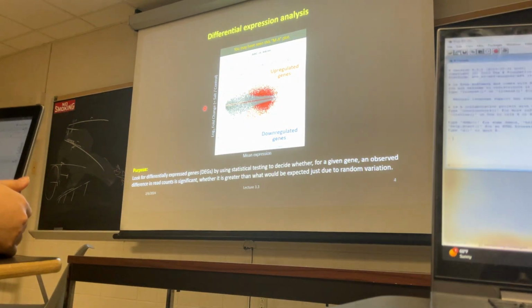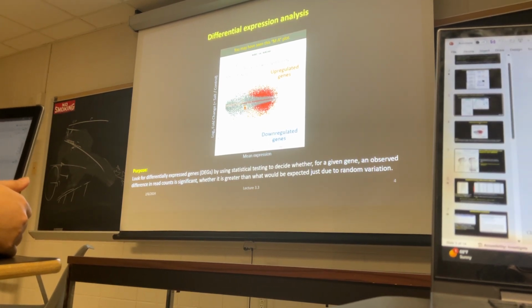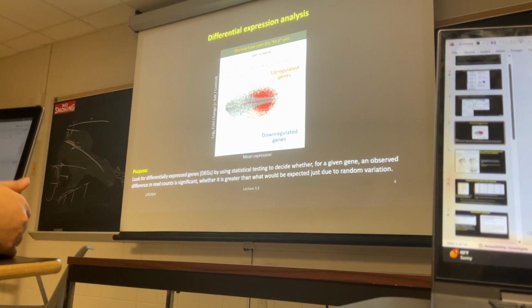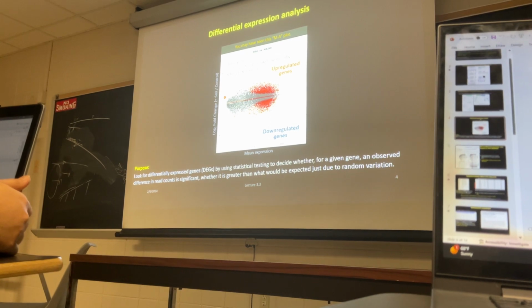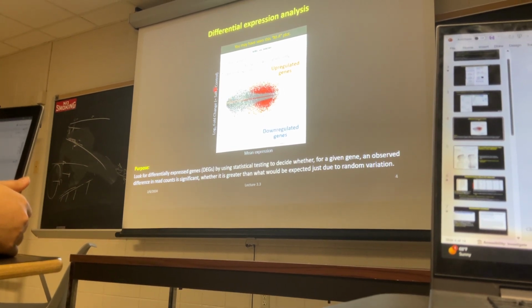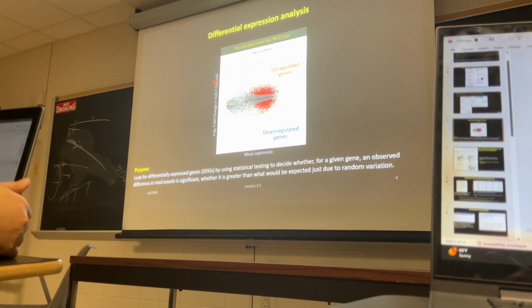And then if you did the DE-seq tool over the weekend, you will see this type of a plot, where you will see so many gray dots and few either red or blue dots. You can manipulate this plot, make it as pretty as you want. And whatever this red dot above this 0 line here, this is the log2 fold change, where log2 fold change is calculated based on the expression of that, each dot here is the gene.